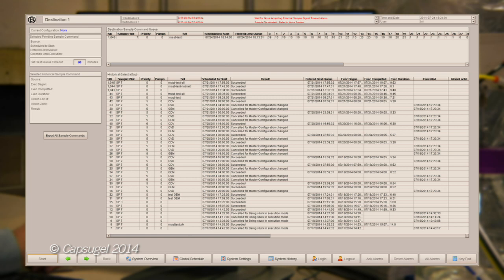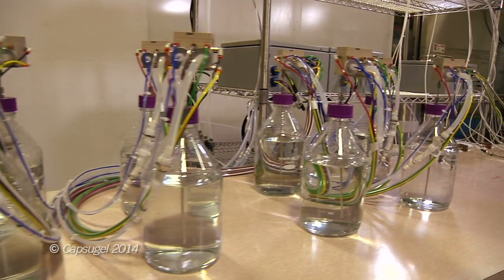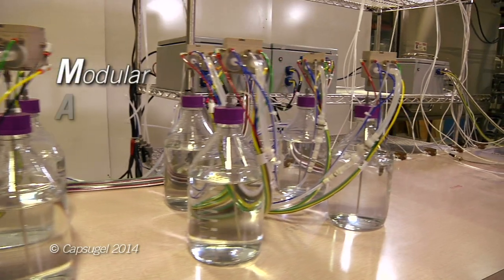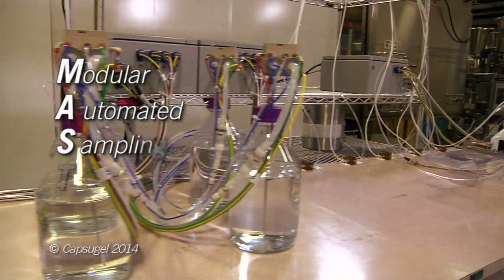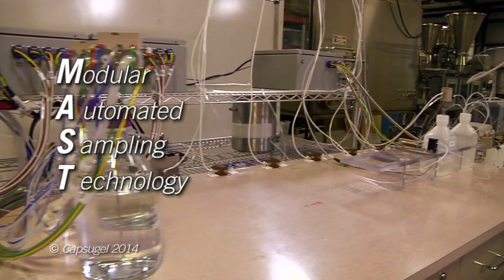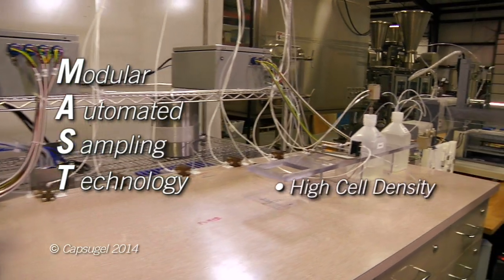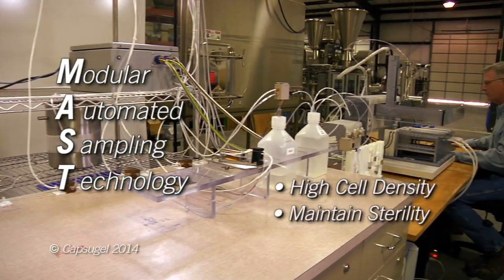An open-platform SQL database records all of the sampling history, giving each sample a unique sample identification number. The MAST system is the first truly modular automated sampling technology specifically designed to process your highest cell density samples and ensure bioreactor sterility.